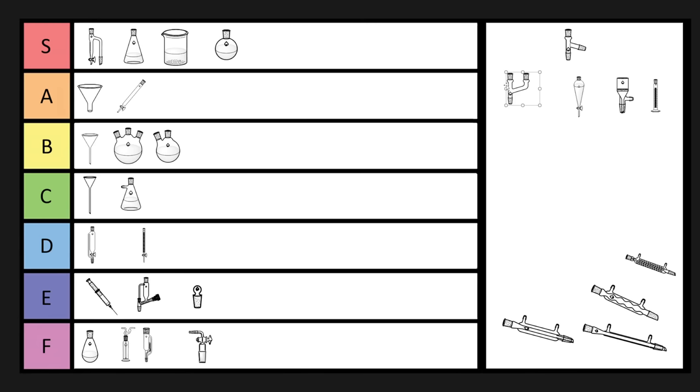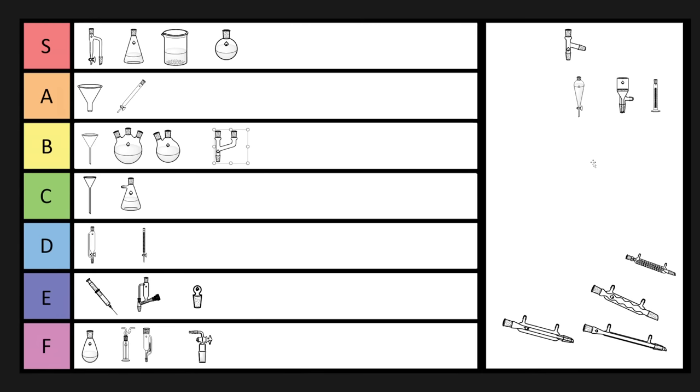Now, Claisen adapter is useful because you can have an addition funnel on top, or you could have a sidearm adapter going to nitrogen or a purge, potentially, or a balloon of argon. So Claisen adapters are pretty good. Now, they're usually pretty big, so they don't fit in drawers and stuff, so I'm going to put it in B-tier because it's a little bit annoying to store those things.